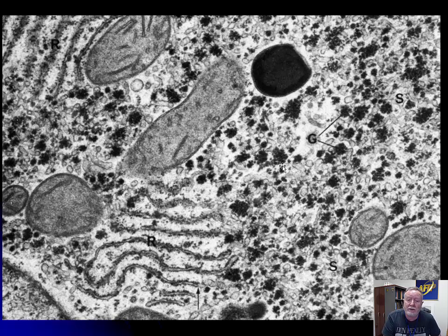Okay, let's do a little detective work. Mitochondria, very few cristae. Okay, a lot of matrix. Couch potato mitochondria. I'm already thinking of liver. Anything else that's going to help us with liver? Well, here's a big round thing of fat. You see a lot of fat in liver. Then the other aggregates here, this is what I want to bring up.